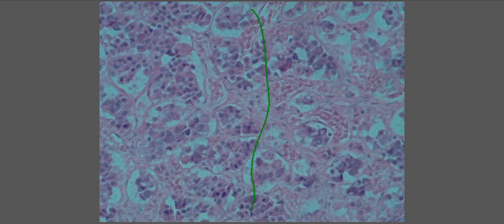Group 5 wants to take that. Yeah. The pituitary gland or hypophysis, right? So what I was showing you here, I have to raise this. So this is what specific lobe of the hypophysis? What specific lobe is being shown here? This is anterior. All right, so this is the anterior hypophysis.